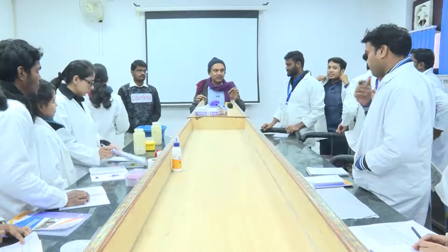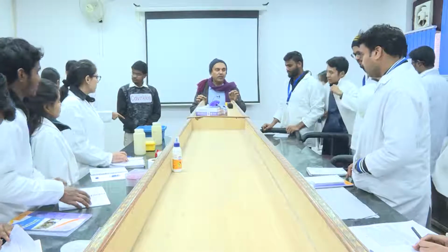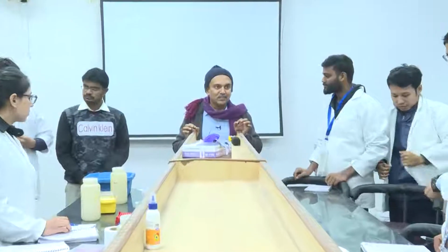Sample, say soil, and how do we make sure that you are able to extract all the DNA from the soil sample? Is it possible to extract all the DNA from a soil sample? No, depending on the matrix which you select, it becomes really difficult. If you have a pure culture from a broth or a culture medium, maybe it is possible to extract all the DNA from the bacterial cells. But again, theoretically it may look possible, but even with the culture, you won't be able to extract all the DNA.